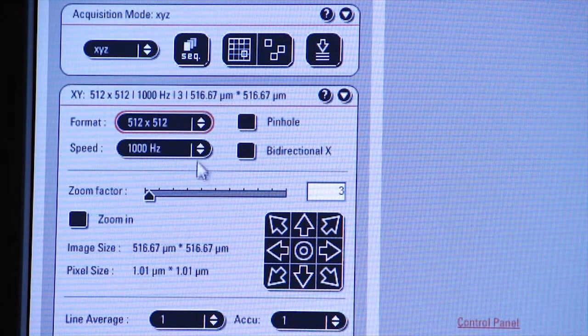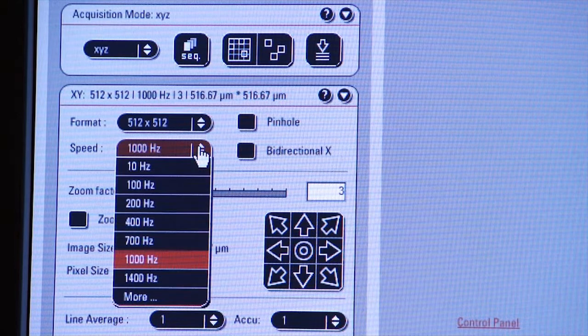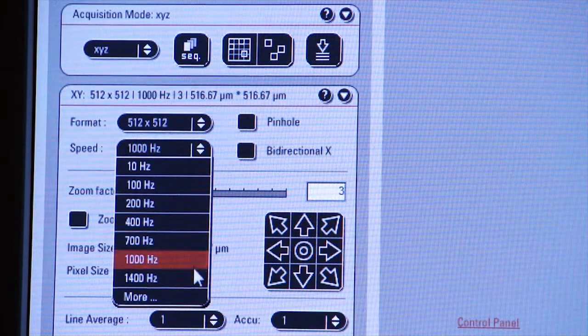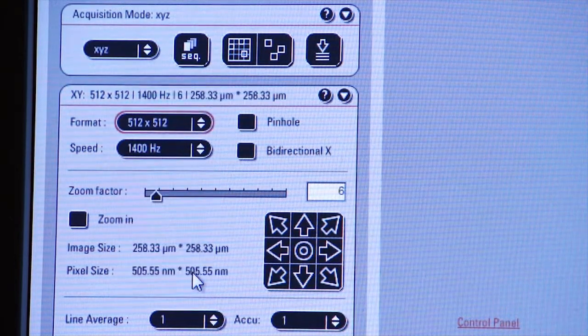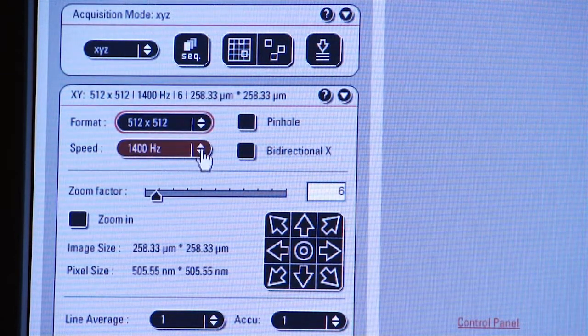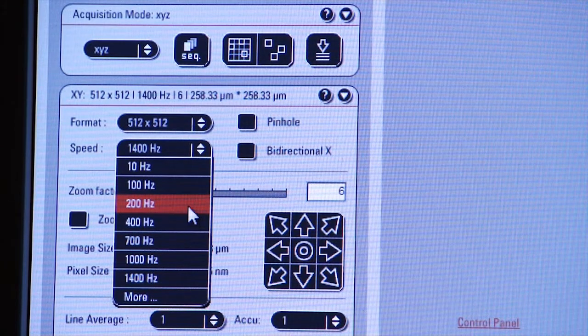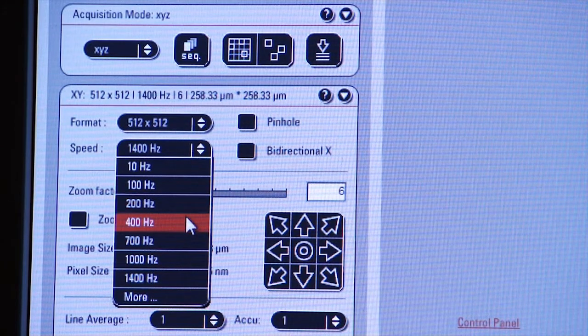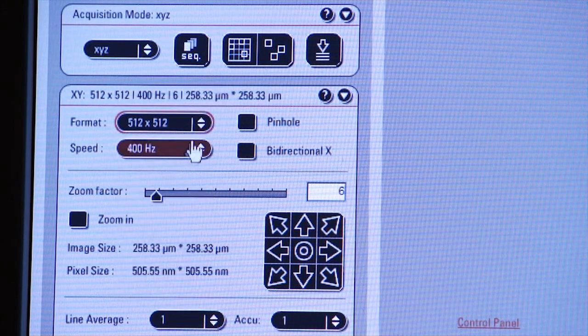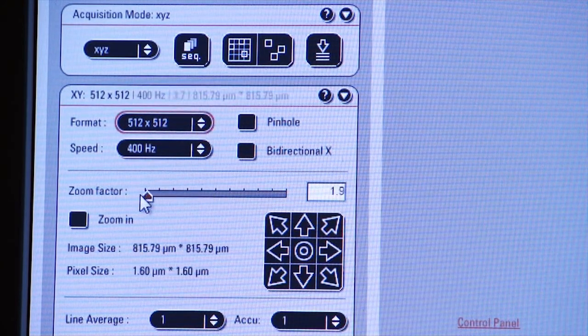Notice that when we select 1,000 Hz and higher, a zoom function engages. Let's go back to 512 by 512 at 400 Hz, and our zoom factor should be down at 1.